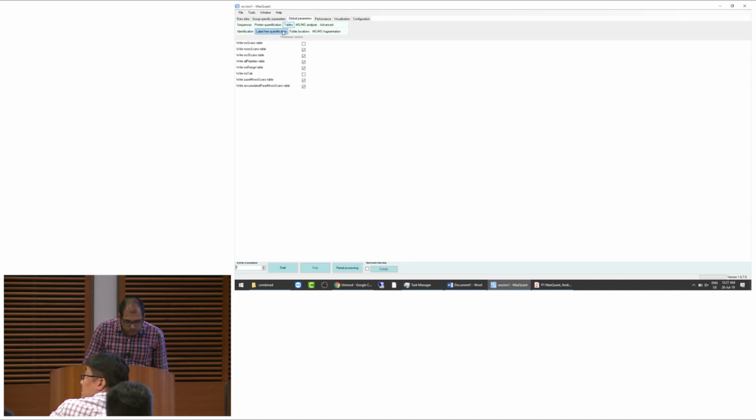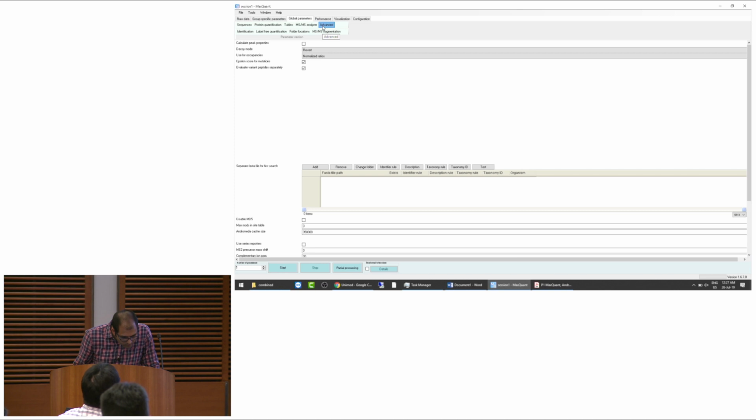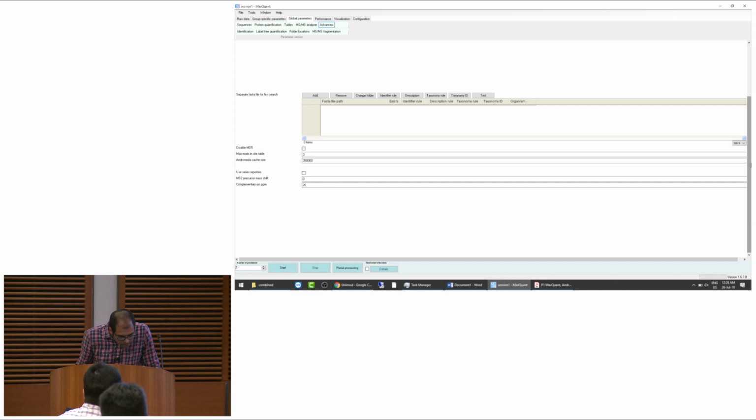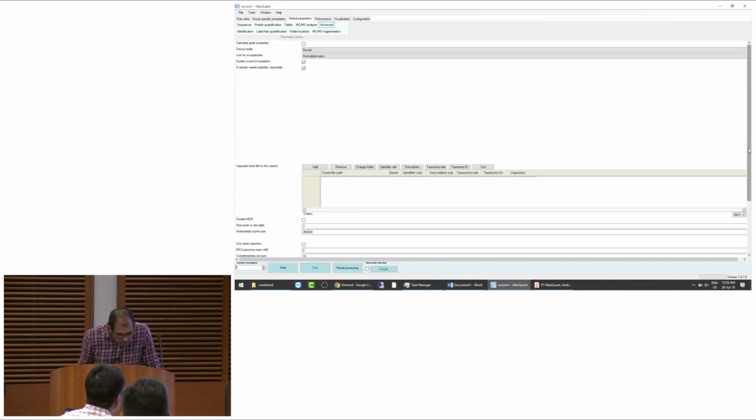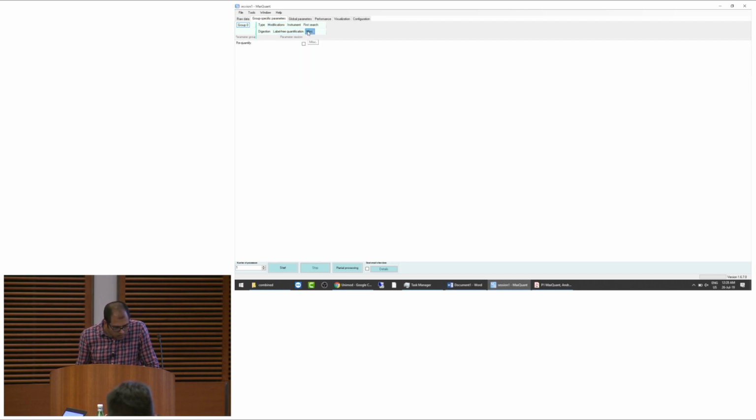I can't find it. Maybe in miscellaneous. Quantification, maybe. Yeah, but I think there is an option.